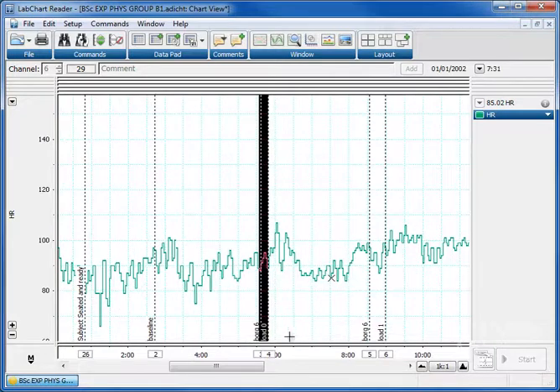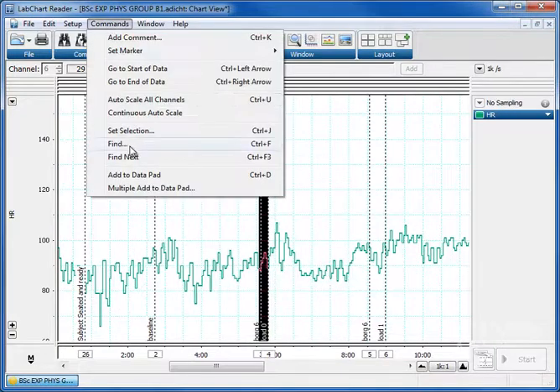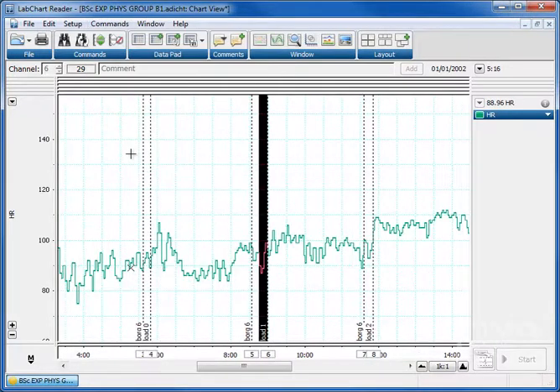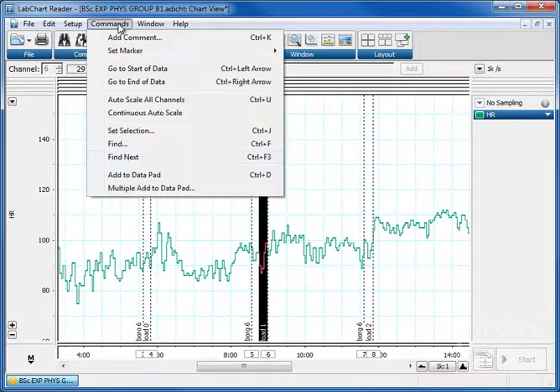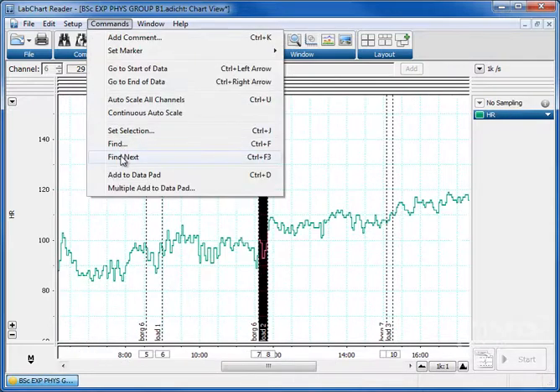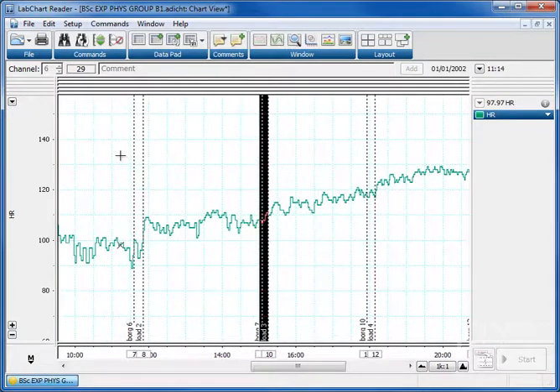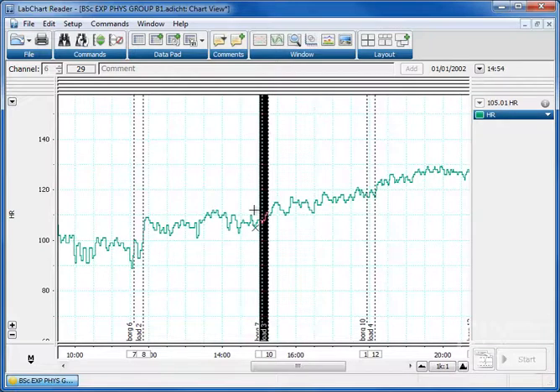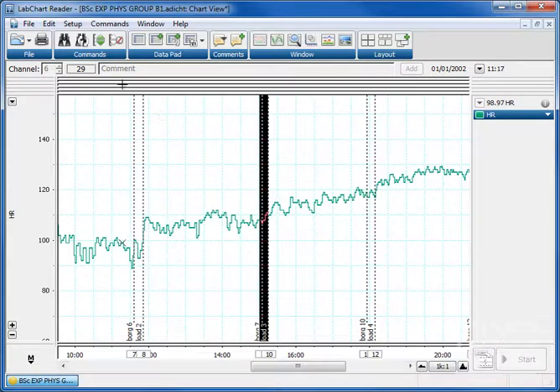And it would find load naught. You could then find the next one, load one. Find the next one, load two. Find the next one, load three. It's going to select the place at load, highlight the 15 seconds prior to that data marker and carry on. And each time you can add it to the data pad.